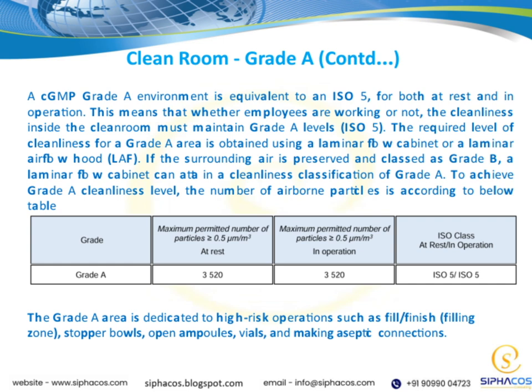To maintain this level of cleanliness, we use specialized equipment like laminar flow cabinets or laminar airflow hoods, known as LAF. Even if the surrounding air is only classified as Grade B, a laminar flow cabinet can create a localized environment that achieves Grade A conditions.